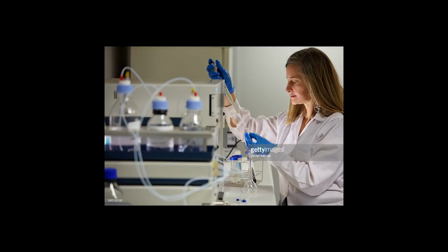Displacement chromatography. The basic principle of displacement chromatography is a molecule with a high affinity for the chromatography matrix. The displacer will compete effectively for binding sites, and thus displace all molecules with lesser affinities. There are distinct differences between displacement and elution chromatography. In elution mode, substances typically emerge from a column in narrow, Gaussian peaks. Wide separation of peaks, preferably to baseline, is desired in order to achieve maximum purification.